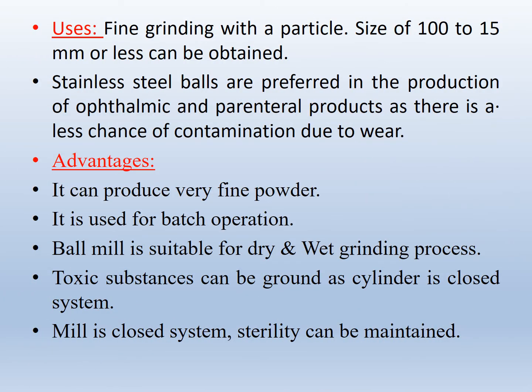Uses: fine grinding with a particle size of 100 to 15 mm or less can be obtained. Stainless steel balls are used in the production of ophthalmic or parenteral products, as there is less chance of contamination due to wear. Advantages: it can produce very fine powder.